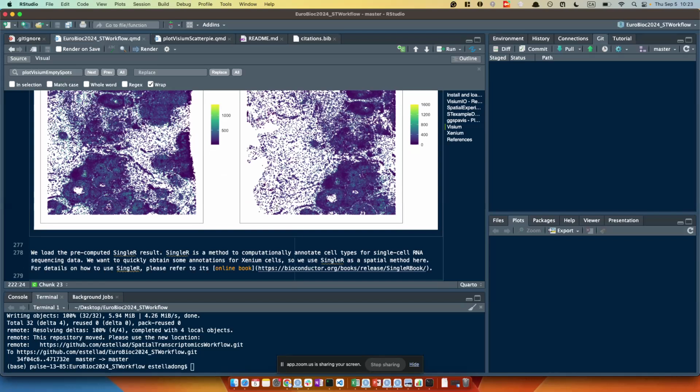So I call it plot spots, but maybe the name is open to discussion. It's always plot spots, because I think the cells can be understood as spots as well, and I want to simplify the naming.